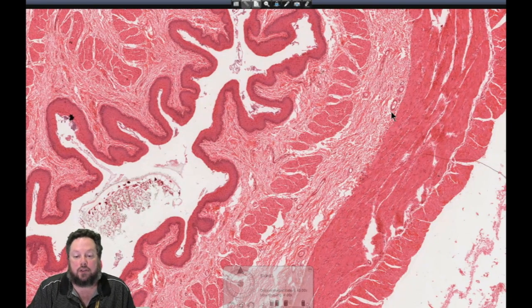So in the upper third, they provide a lubricating mucus for the food bolus to move down, and then in the distal third, they're also mucus glands, but they're providing a protective mucus lining from acid reflux. So there's always sort of some form of acid reflux taking place, and so we have this thick protective mucus being secreted in that region to help protect it from that acid.